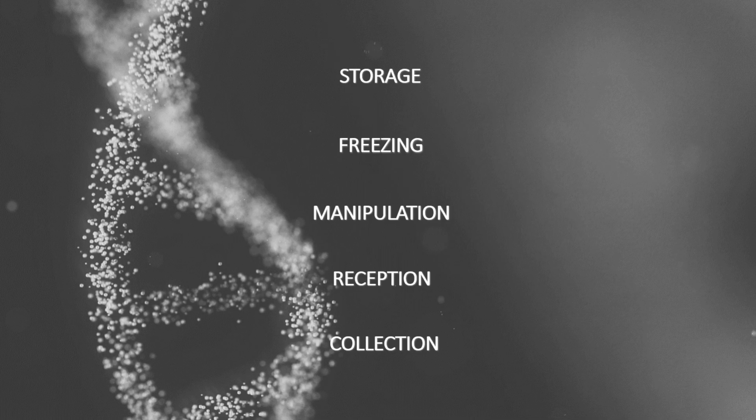The workflow takes shape from the collection site to the laboratory, from the storage area to the transplant area, where the adequate therapies are monitored. Let's now take a detailed look at some checklists designed for every single module, from collection to logistics to process, concluding with therapy.